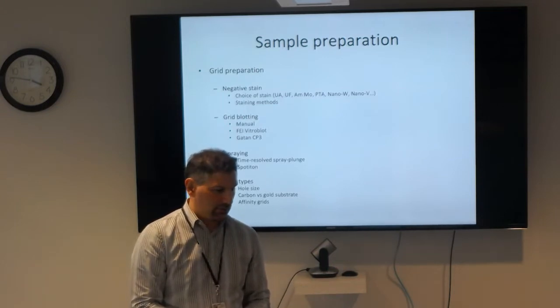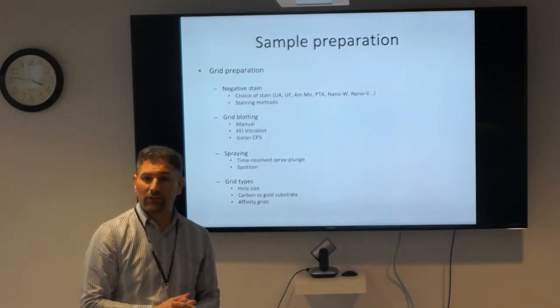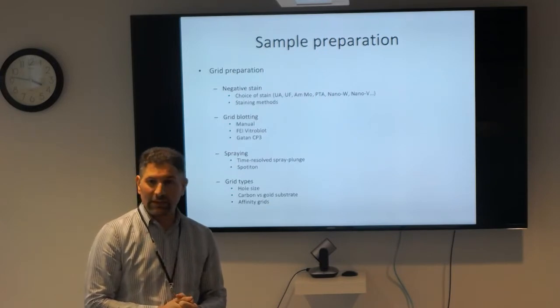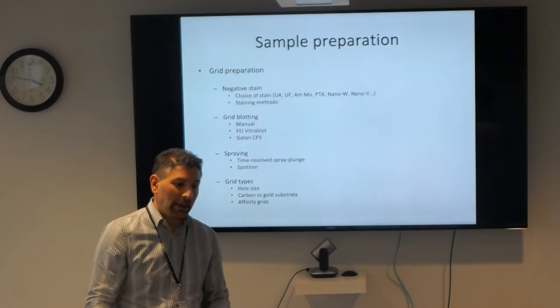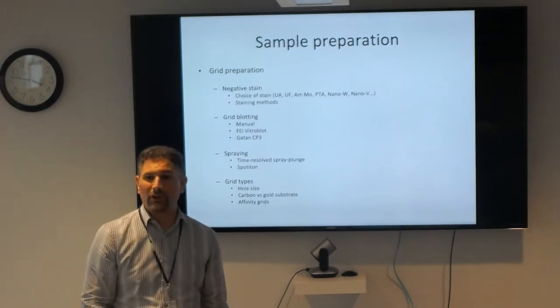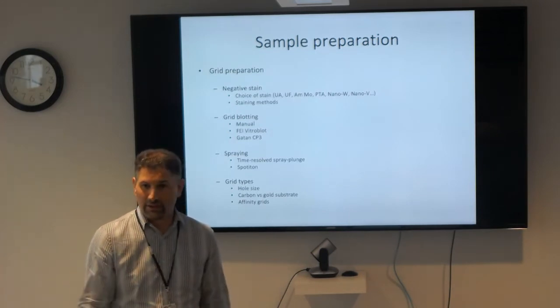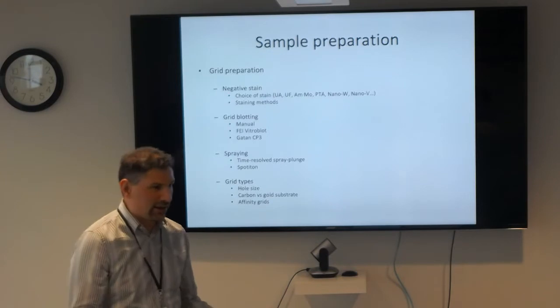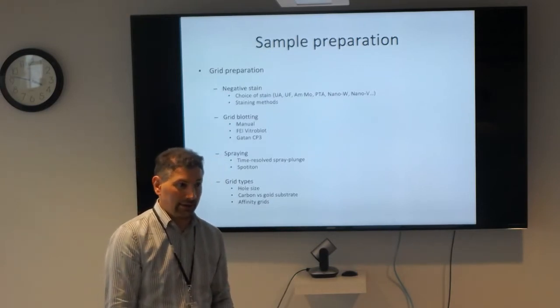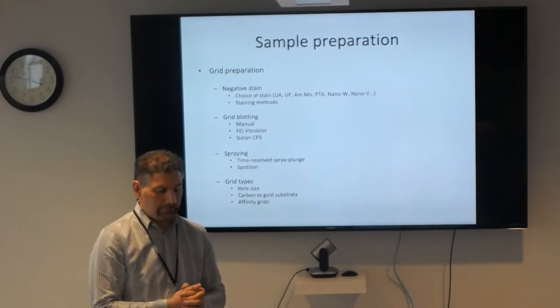I think when you have situations where particles essentially get stuck in the air-water interface, it's also had good success with that. So again, trying these different things will actually end up helping the data processing at the end, because if garbage goes in, garbage comes out. I've spent a lot of time processing garbage, and you end up burning a lot of time. You try a lot of different things, but it just doesn't work out. That doesn't mean not to try it. Try it because at least you understand what's going on. You understand what garbage is.